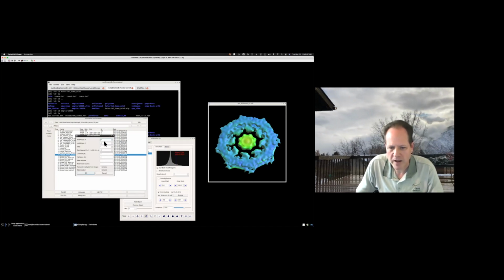It allows me to select a subset of the images. If I leave it as -1, it'll use all the images in the file. I can also specify a step. So if there are 10,000 images, I maybe want to look at every 1,000th image or every 100th image or something like that. So here maybe I'll say every 5th image, so we only see 10.